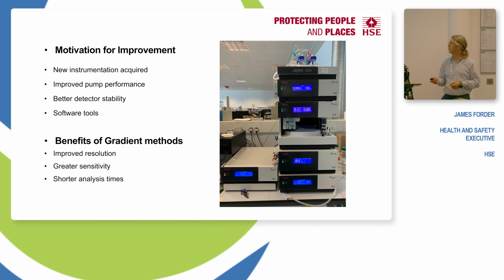So moving on, why do we want to change? Well, we got a nice shiny new instrument, and we use it for a lot of different HPLC methods, but through that use we realised that pump performance was much improved and the detector stability from the instrument was excellent. And also you have software tools that allow you to subtract the background. So in general, why would we want to go to gradient methods? You get improved resolution, greater sensitivity, and ideally normally shorter analysis times.